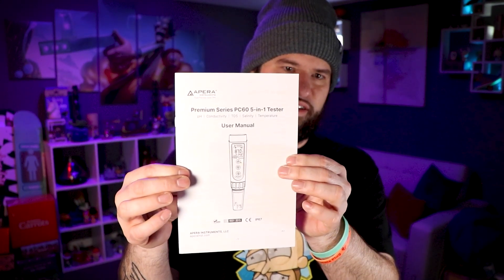Inside here you get a little attention note, a thank you for choosing Apera card, a ton of paperwork, and a quality certificate. Meter measurement error is plus or minus 0.02, and it's already been calibrated right out of the gate so we don't have to worry about that for a little while. We also have our premium series PC60 five-in-one tester user's manual — I'll give that to Dani. And there's this entire little quick-reference card covering calibrations, how to rinse the probe, how to install the batteries. It's like a short version of the manual — really nice if you need a quick reminder.